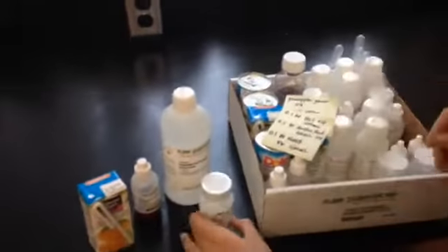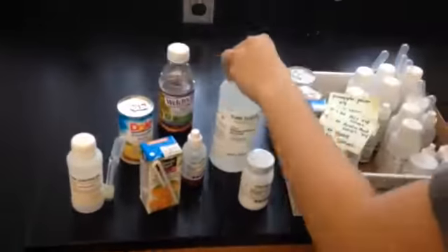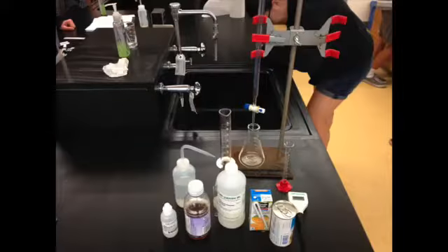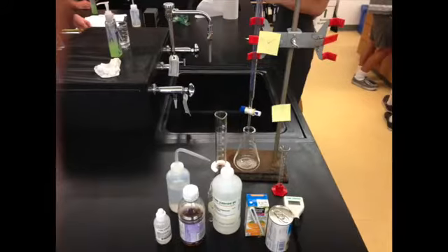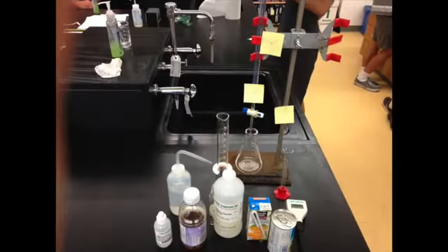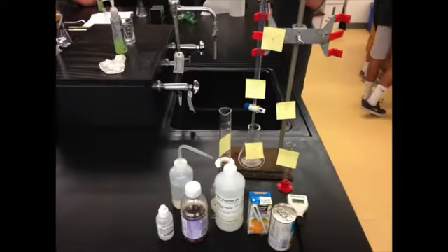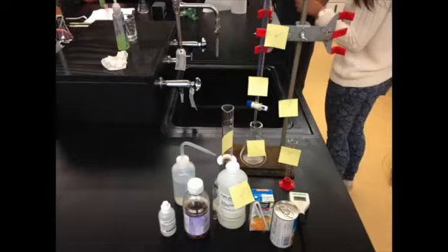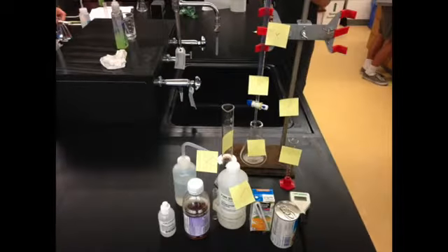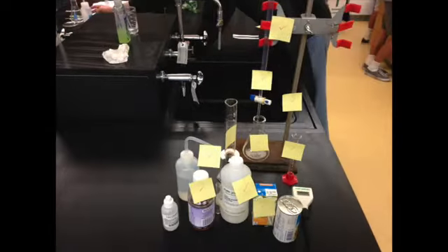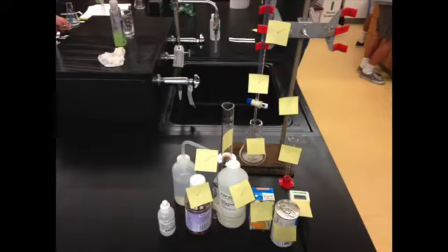The first step of any lab is gathering the proper materials. For this lab, you're going to need a burette clamp, a ring stand, a burette, an Erlenmeyer flask, graduated cylinders, sodium hydroxide, deionized water, white grape juice, orange juice, pineapple juice, a pH meter, and phenolphthalein.